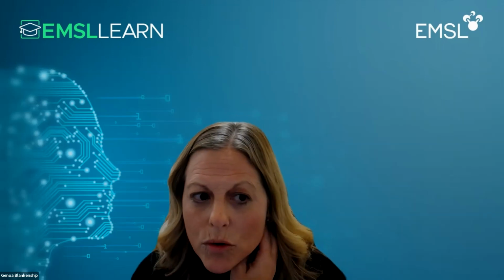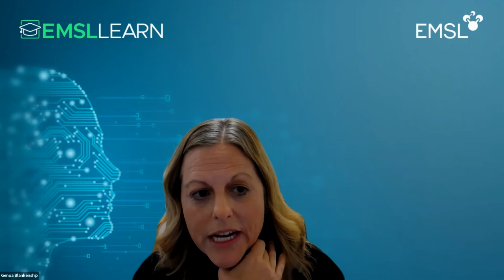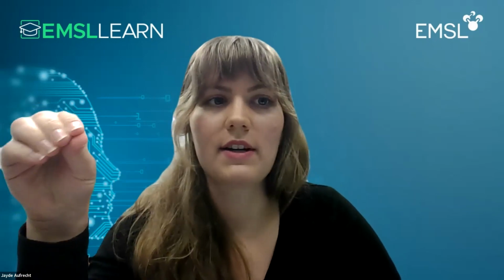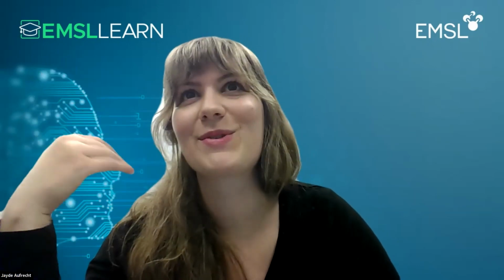Okay. Jade, question for you. Can you control where the microbes are added to the plant in the rhizochip to study chemotaxis towards the root, or whether or not the root will grow towards the microbial signal? Yeah, so you can actually do that pretty easily. You just create another inlet on the rhizochip where you can insert the bacteria or fungus. We have tried that and added fungus to a different area of the rhizochip and actually saw the roots grow towards the fungus, which was surprising. So yeah, you can change where you're adding and inoculating the plant.